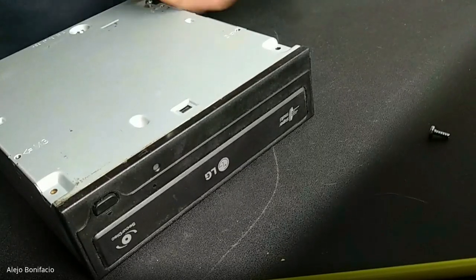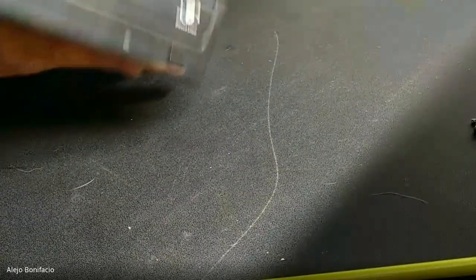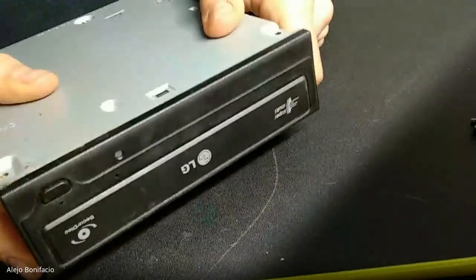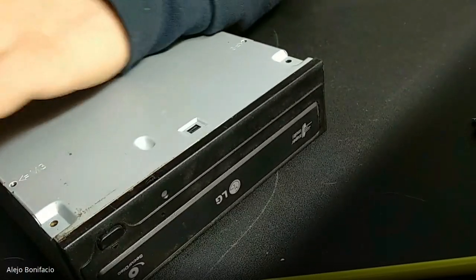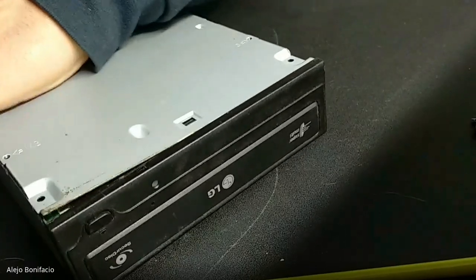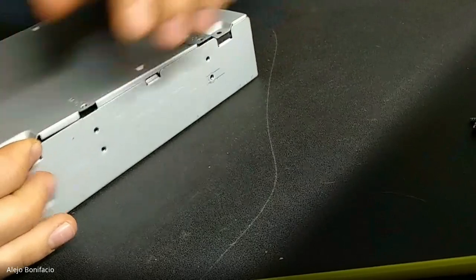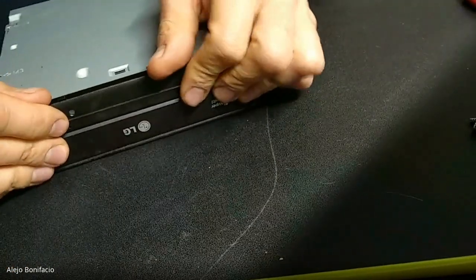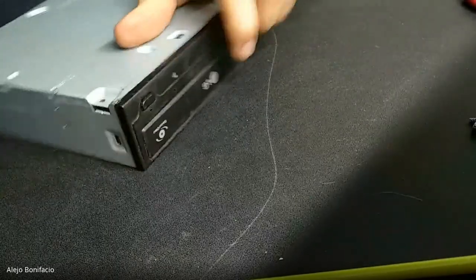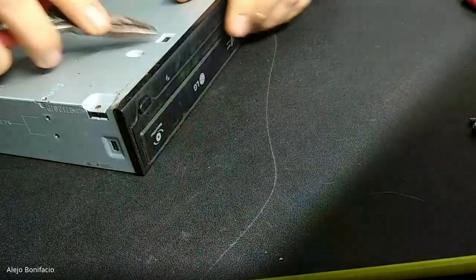We are going to try to use these kinds of devices because right now they are mainly electronic waste, and we don't want to produce electronic waste. We want to recycle and make some interesting devices — open devices for community science.